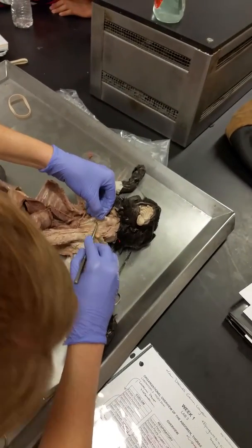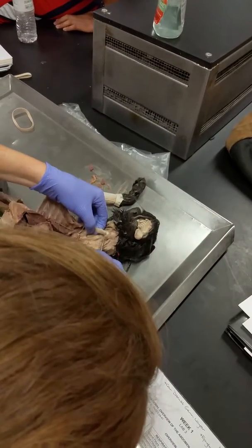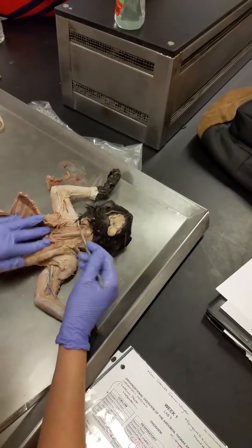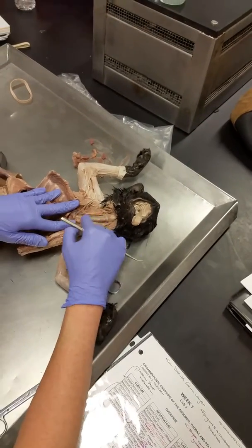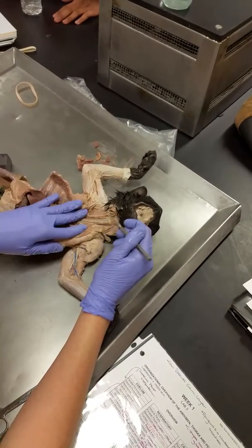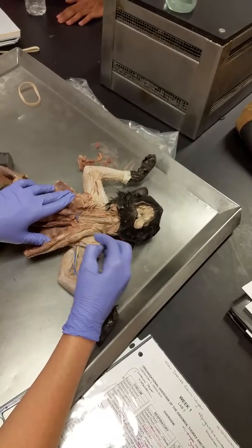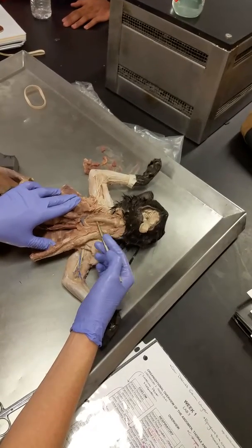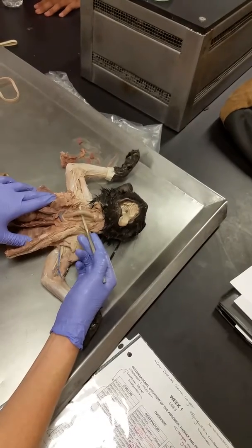What I'm holding on to right now is the trachea. The trachea is the pathway of air from the mouth or the nose down to the lungs. And it has rings in it. So if you ran your finger along the trachea, you'd feel the cartilaginous rings. The trachea has those rings in it to keep the trachea open. Later in the quarter, we'll talk more about those rings. You will have to know the function of those rings, and that's to keep the trachea open.